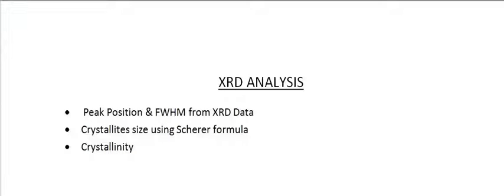Hello everyone. In this video, we will learn about the XRD analysis, in which we will cover three important topics. First, we will see how to calculate the peak position and FWHM, that is the full width half maximum, using the XRD data. And then we will continue to calculate the crystallite size, and for that we will use the Scherrer formula.